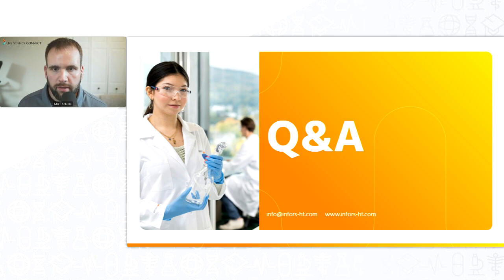So let's get into these questions. Rui, I'm going to start with you on this one. You mentioned that JIB is working on having a suspension culture platform for the production of viral vectors for gene therapy. Could you talk about what the next steps are based on the results you showed today?